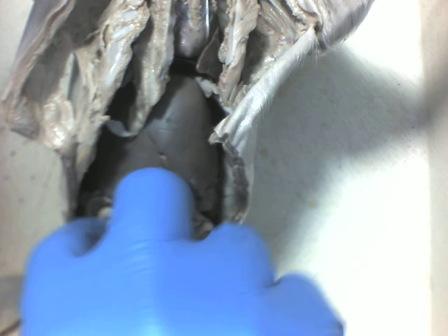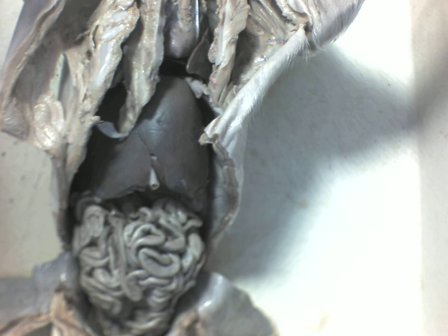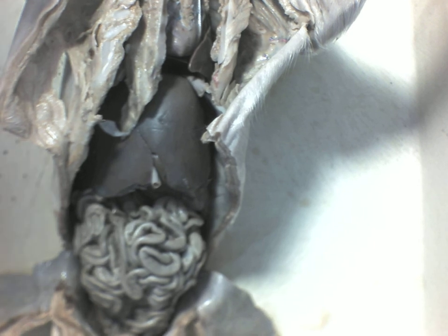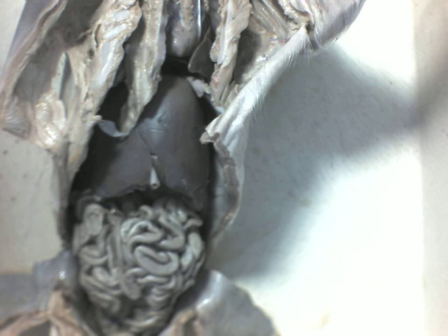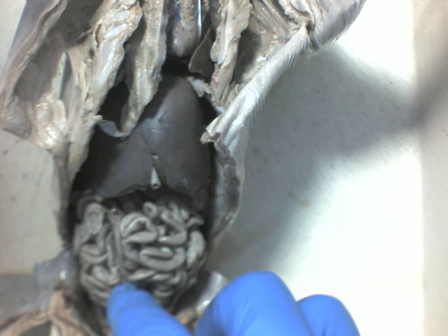All right, so the small intestine, what is the job of the small intestine? Breaks down fats, very good. And what else does it do? Why is it so long? Very good. So it's going to be absorbing the nutrients from the food. So the nutrients are going to be absorbed inside of the small intestine.